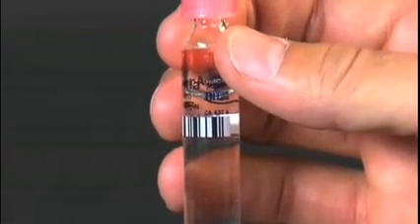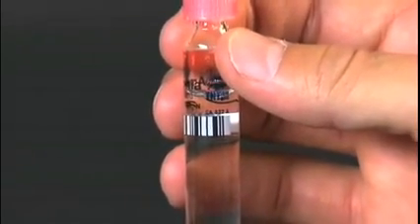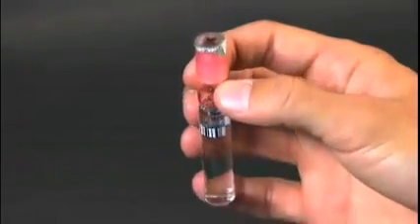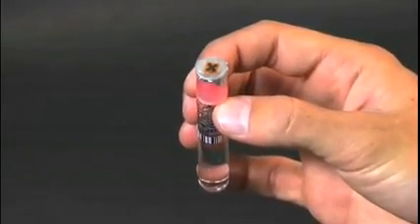Another benefit of the TNT Plus vial is its convenient, pre-measured reagents, like this ammonia test that comes with the revolutionary DoseCap.